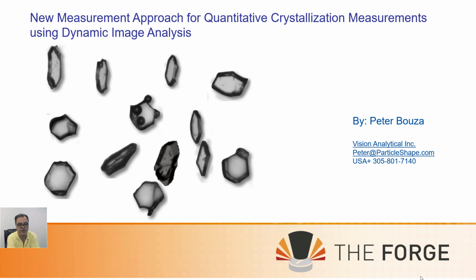I work at a company called Vision Analytical, and today I will be discussing using a new approach to a measurement method for the crystallization process to get some quantitative, not just qualitative, but quantitative analysis using dynamic image analysis.